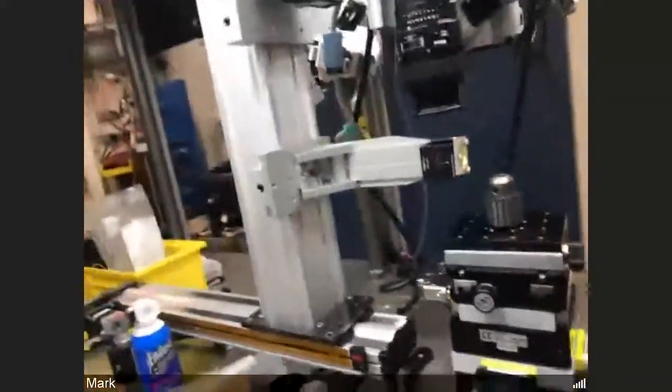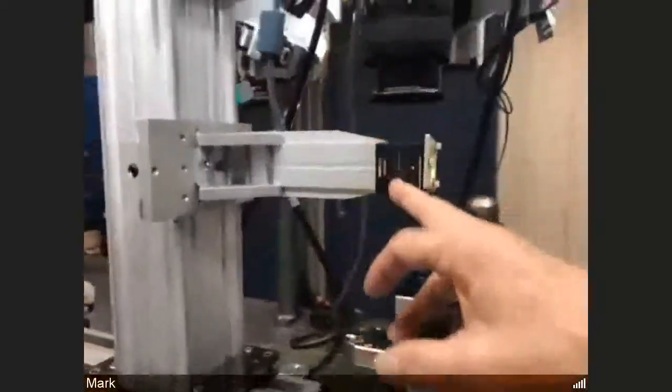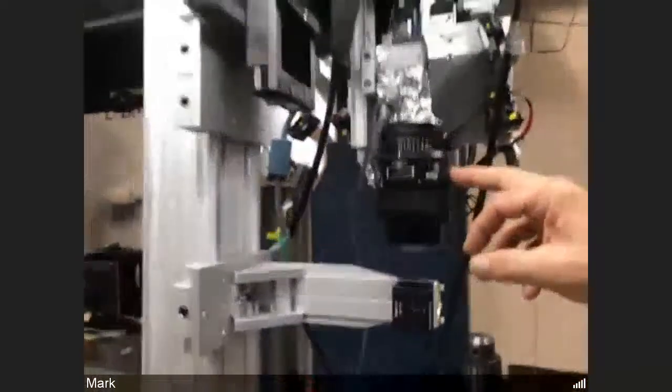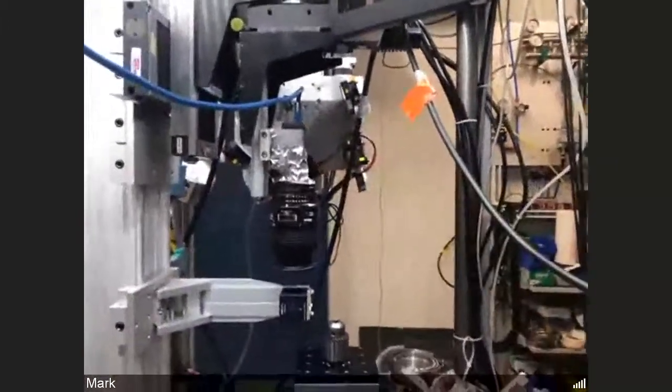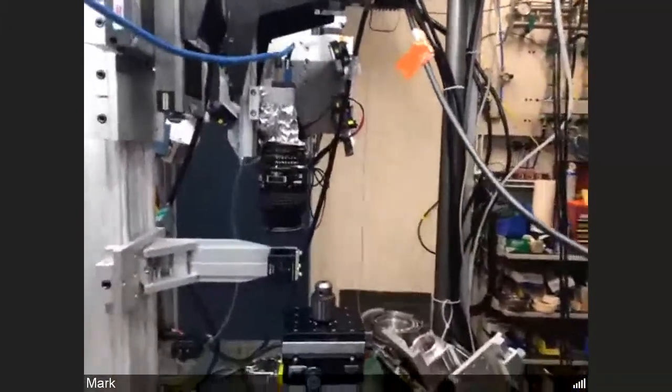This is the scintillator that converts the X-rays to visible light. I discovered yesterday that it had some dirt on it from a previous experiment. So I've tilted it a little bit to get the dirty part out of the field of view. That's why it looks kind of cockeyed. And then this is a 45 degree mirror. This is a Nikon macro lens. That's a 1-to-1 imager. And this is the CMOS camera with a USB 3 connection.